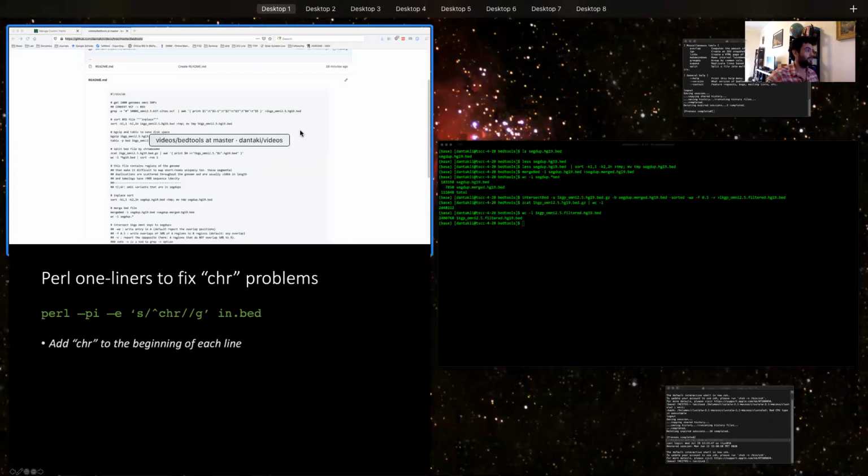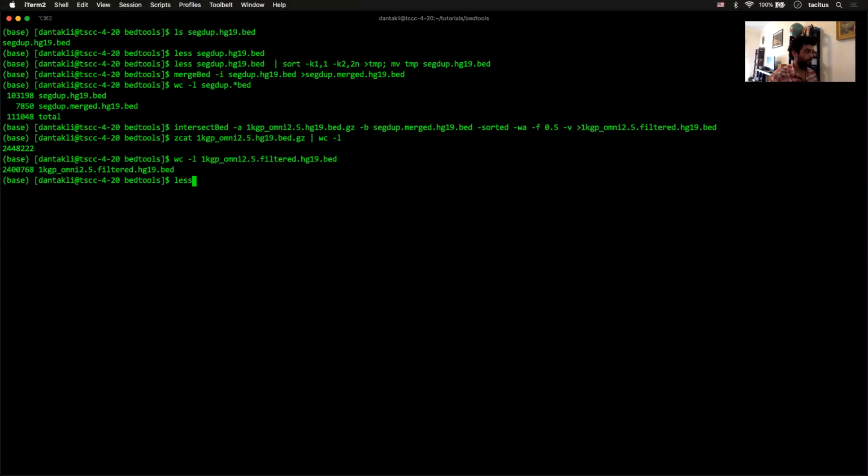So let's look at this file. And if you're interested, this file is on storage, so I can point you to it later.